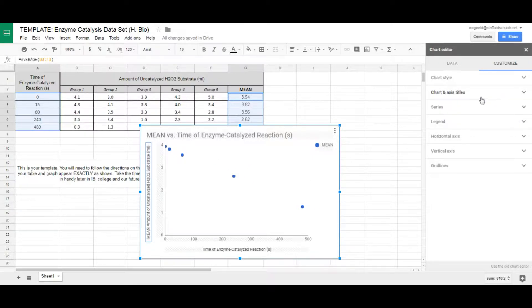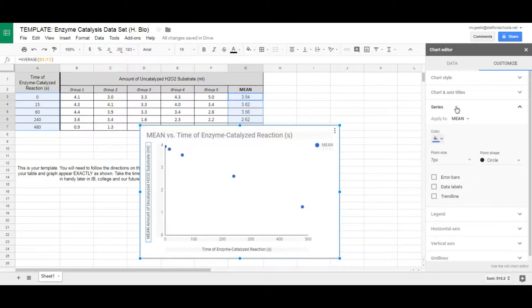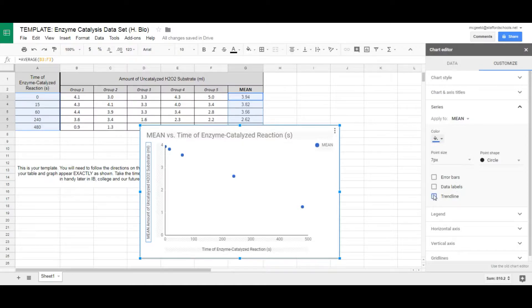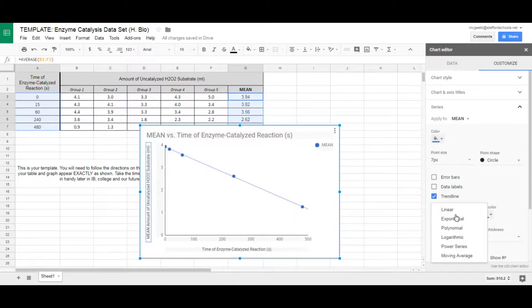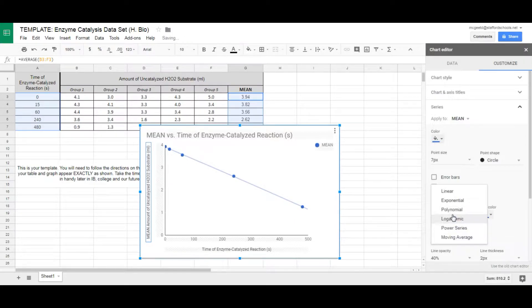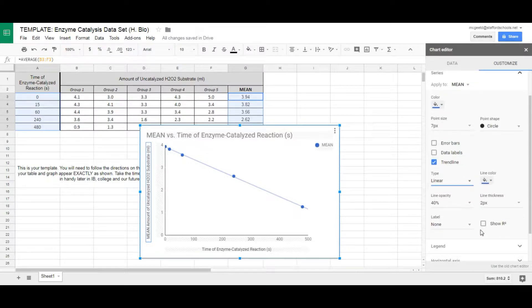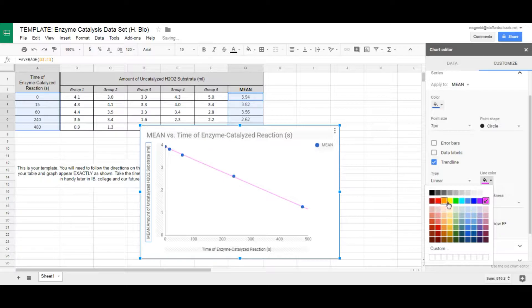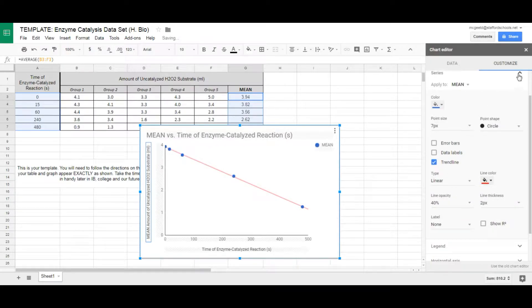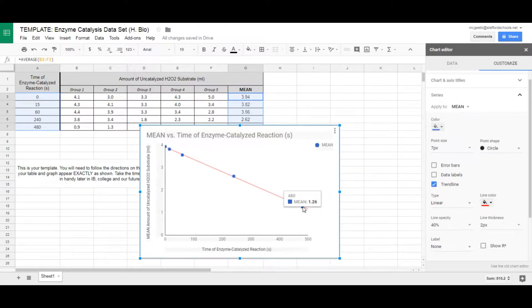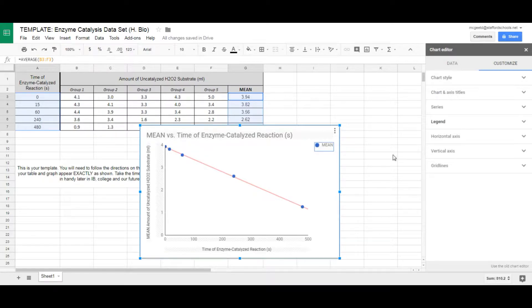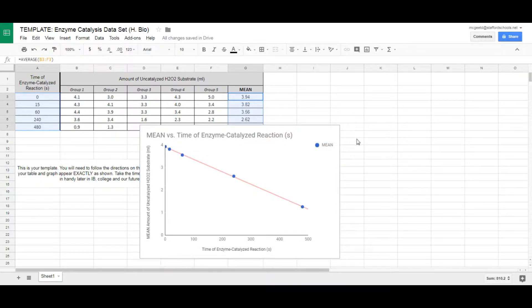Now we want to add a trendline. Go to Series and you'll see a Trendline option — click it and see how it fits the data. You can try different types: it could be polynomial, but exponential doesn't fit well here. Linear appears to be the best fit, so leave it at linear. There does appear to be a linear trend. You can also play with the trendline color if you'd like — just make sure it's visible.